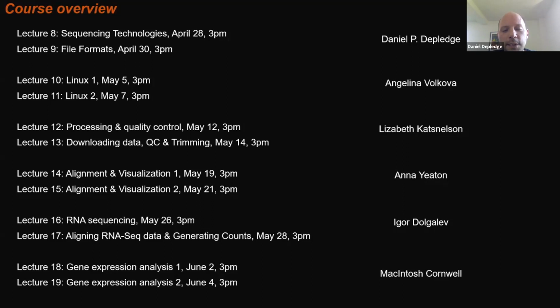Then Igor Dolgolev will take over and give you a primer on RNA sequencing. Obviously, RNA sequencing is a popular topic, but it's also a very big topic. So we won't be able to cover everything, but hopefully it will be enough to get you up and running in the basics of how to take data and generate counts of gene expression and how to perform differential analysis of these. And then finally, Macintosh Cornwall will be going deeper into gene expression analysis. And I think we'll be using programs like DESeq and EdgeR, which are the popular implementations.